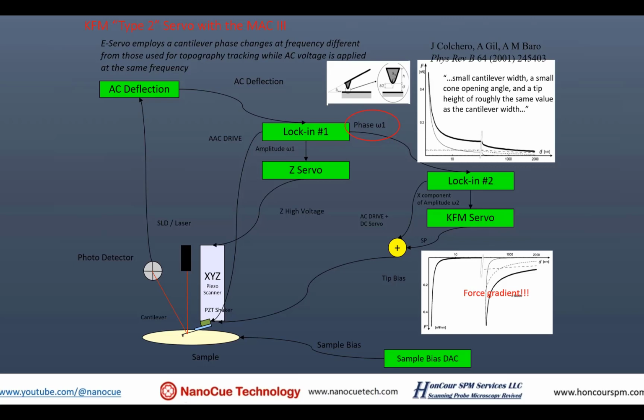The PLL can be super fast. Actually, you can do heterodyne PLLs where you're operating at much higher frequencies than the resonance frequency, and you can theoretically measure the phase faster than a single cycle.